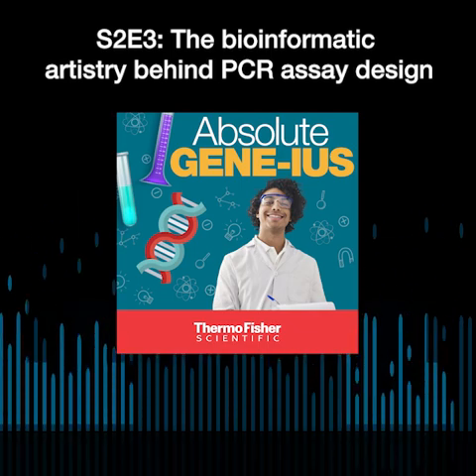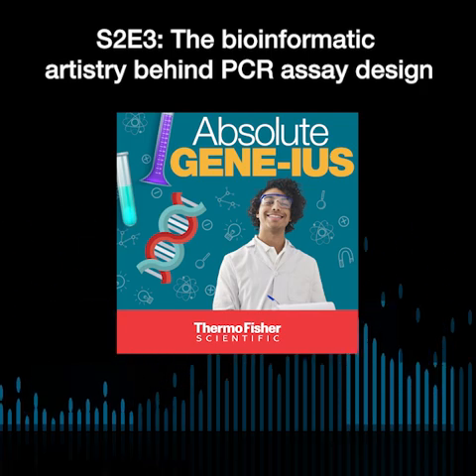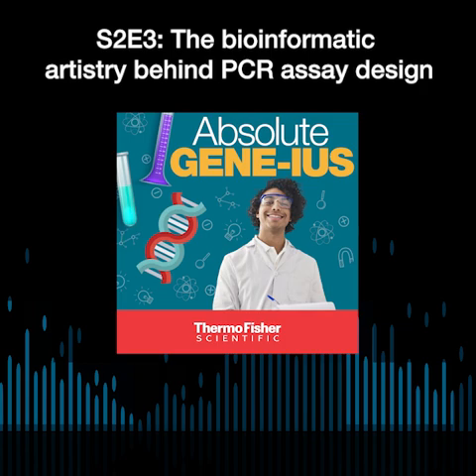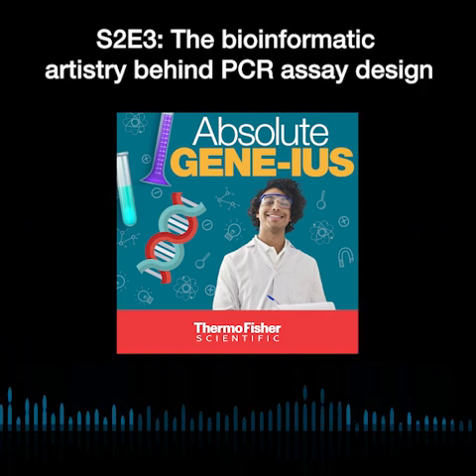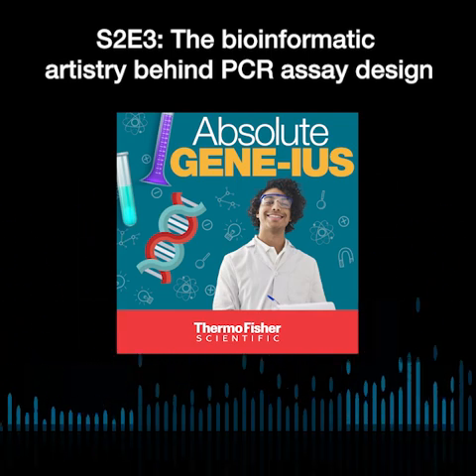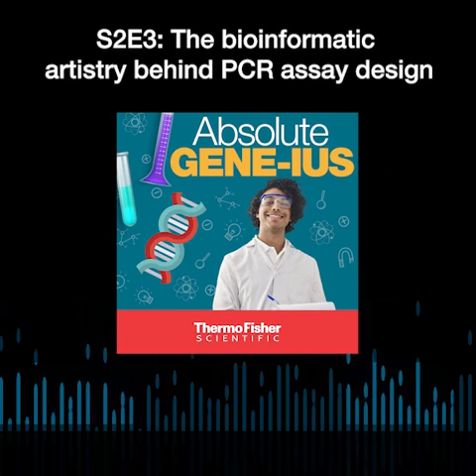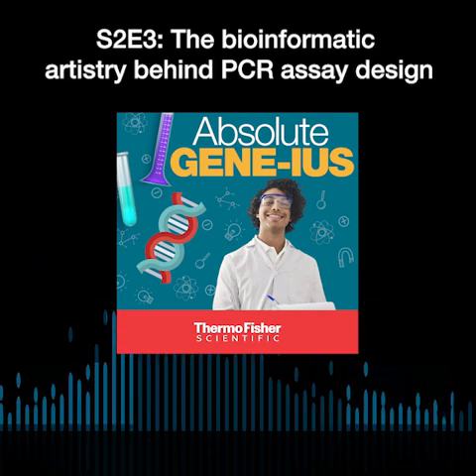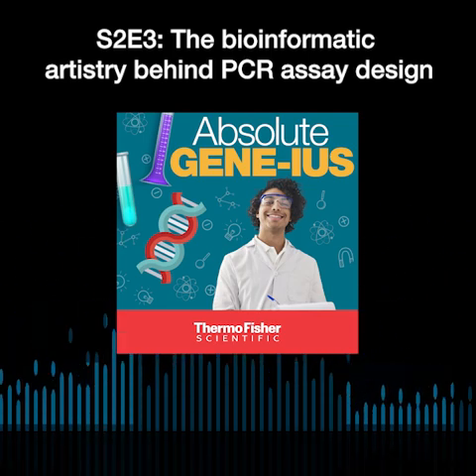Yes. My last question, and we'll pass you over to Cassie for Cassie's career corner. Any advice, maybe from both of you, for a scientist looking to create their own digital PCR assay in the lab? What advice would you give them? I just want to reiterate what Rounak has said, but definitely think about your sample type so you know your amplicon limitations. And an important thing Rounak has brought up to me: don't throw away the assay design just from one test not going well.